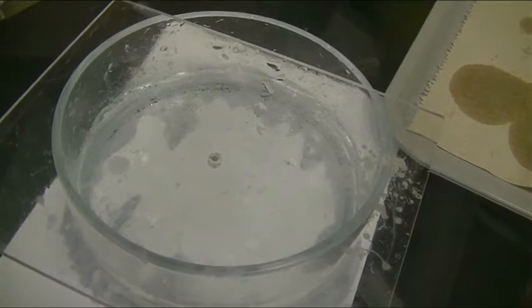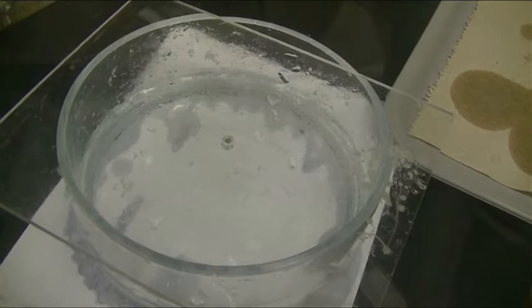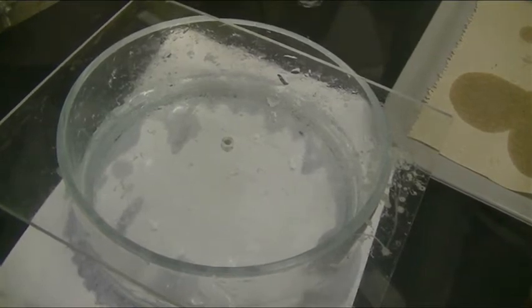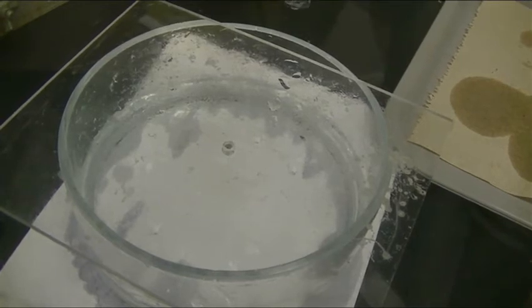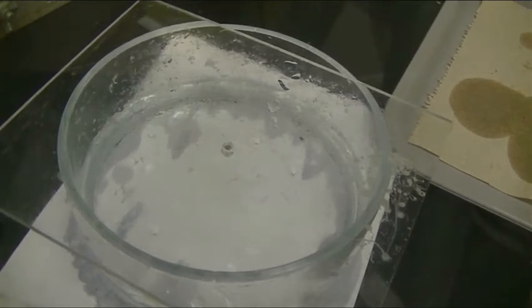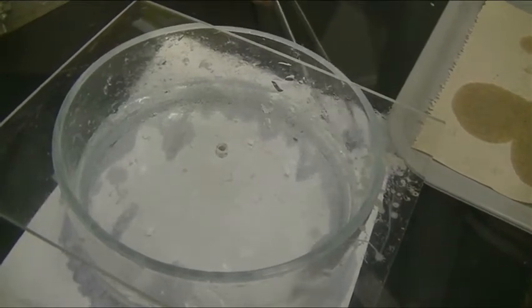All right. I'm going to drop this in. I'm going to run away because I don't like this. All right, ready? So here we go. Potassium in water, one of the most reactive metals we have. Let's go, Mr. Pilcher. All right, here we go. Oh, it's stuck. I don't like that. Oh, it's stuck to it. Just tap it on the... Oh! Jeez, man. Okay. All right.